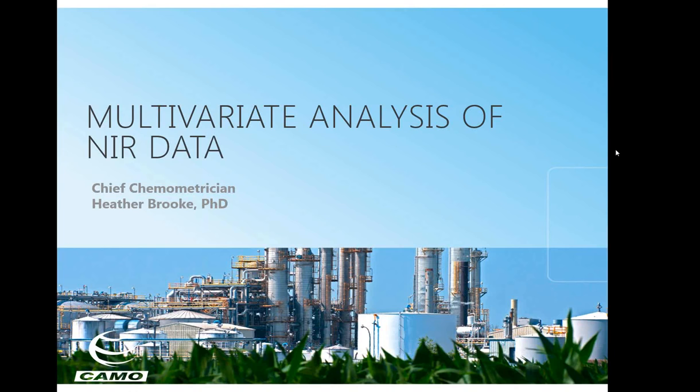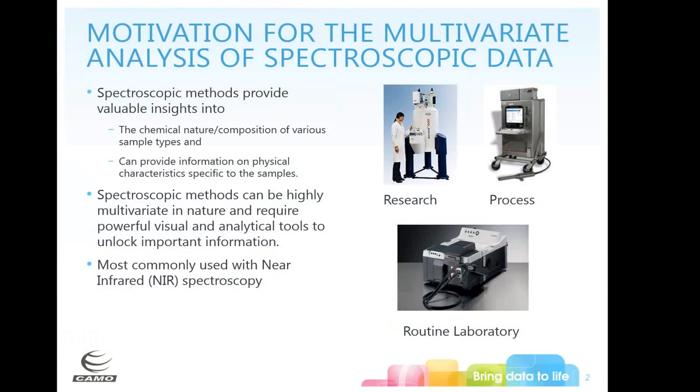So today we're going to talk about multivariate data analysis for NIR data. Okay, so what exactly is our motivation for doing multivariate analysis on spectroscopic data?